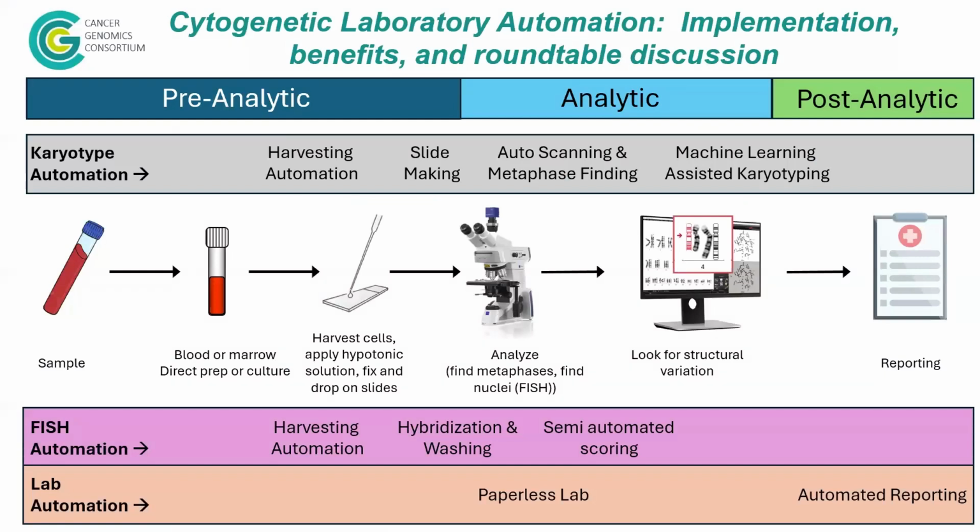Also, I wanted to very briefly talk about cytogenetic laboratory automation. This is a webinar series proposed by Dr. Adrian Dubuc, and we are very pleased to be able to bring this to you. It is going to be a series of webinars because we think there's a lot to talk about, and we didn't want to have a very rushed discussion trying to summarize everything, but really get into a little more detail about what's actually happening.